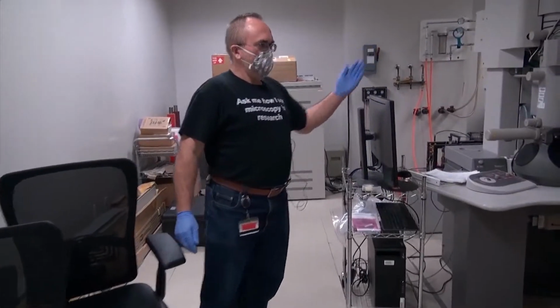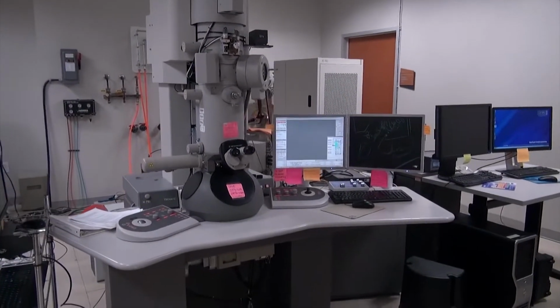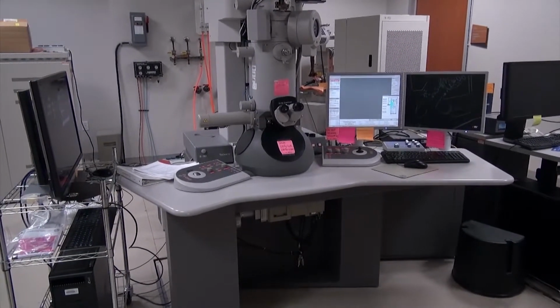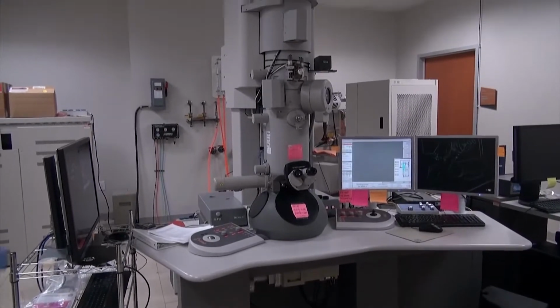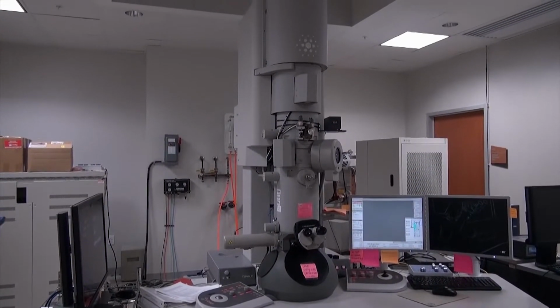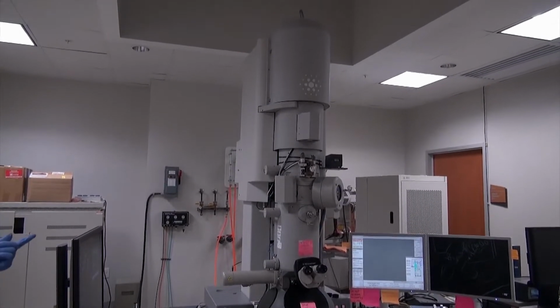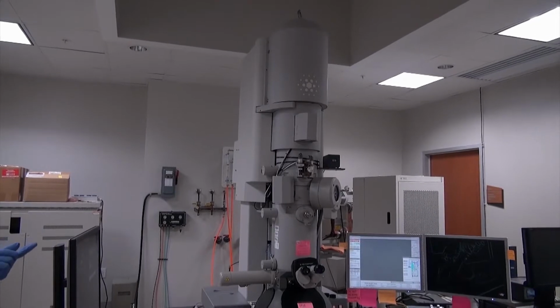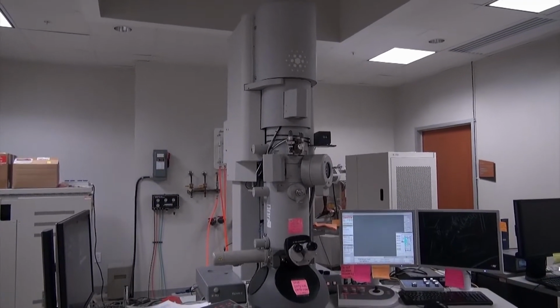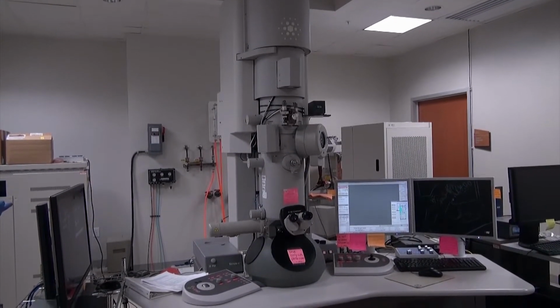So this is our FEI or Thermo Fisher Tecnai Super Twin microscope. This is a 200 kilovolt instrument. It's equipped with a Gatan energy filter. We have an EDS detector from Oxford and it also allows ultra high resolution STEM imaging in the dark field mode.